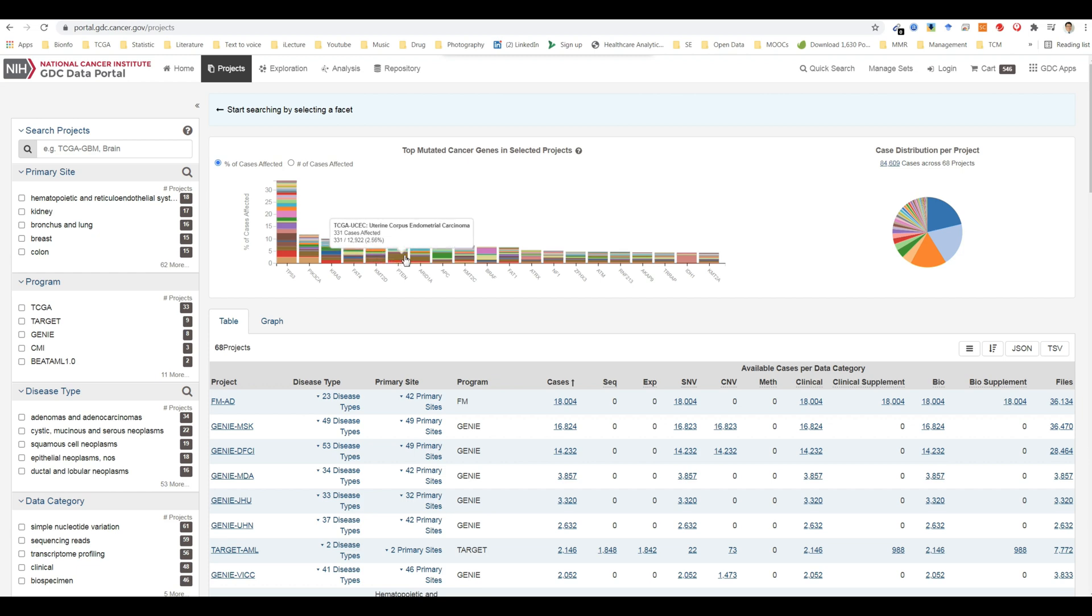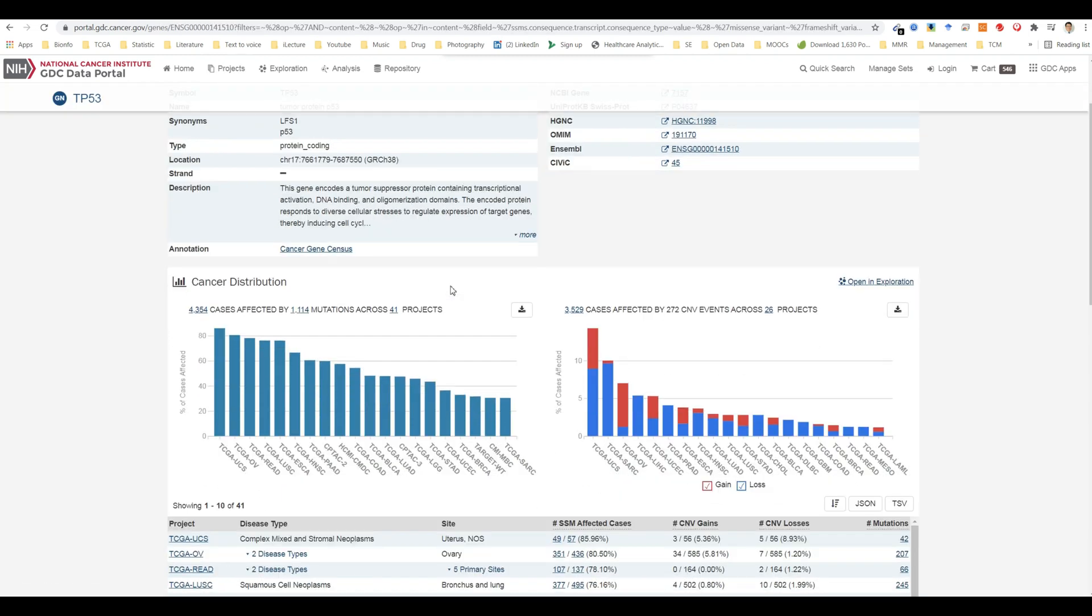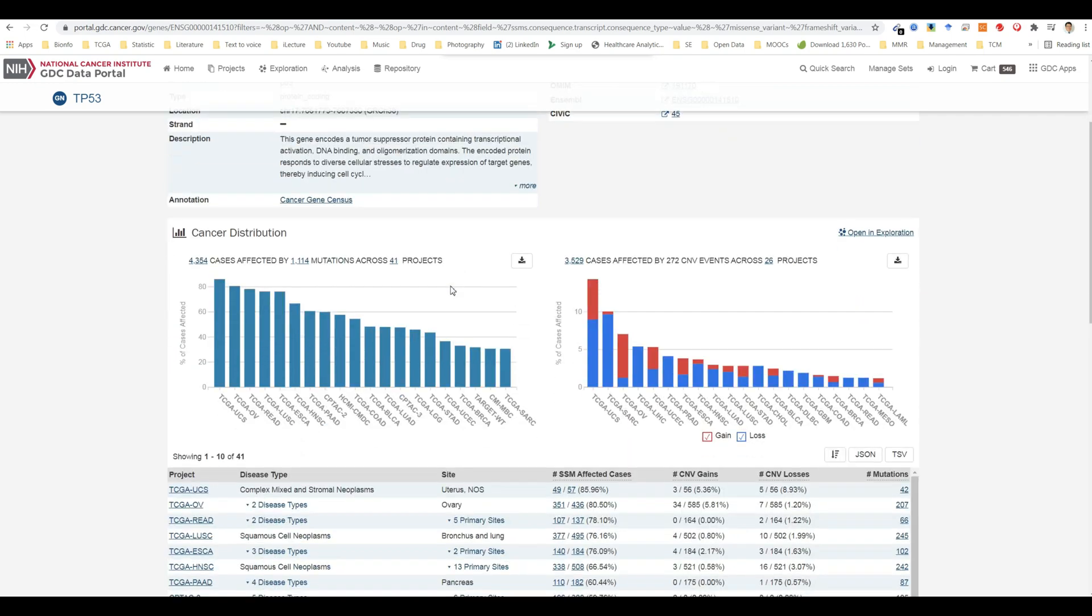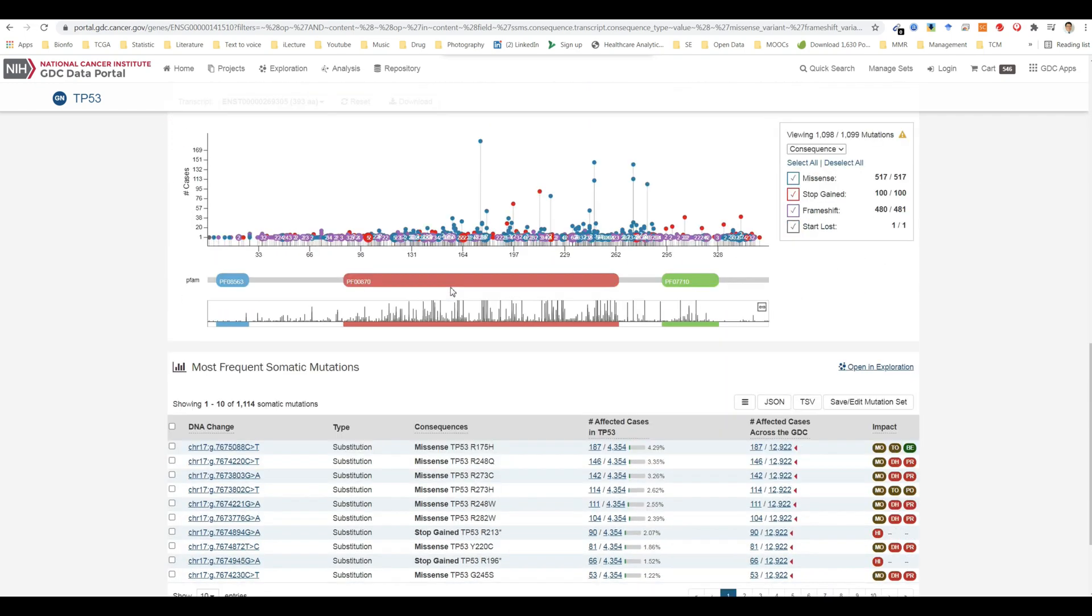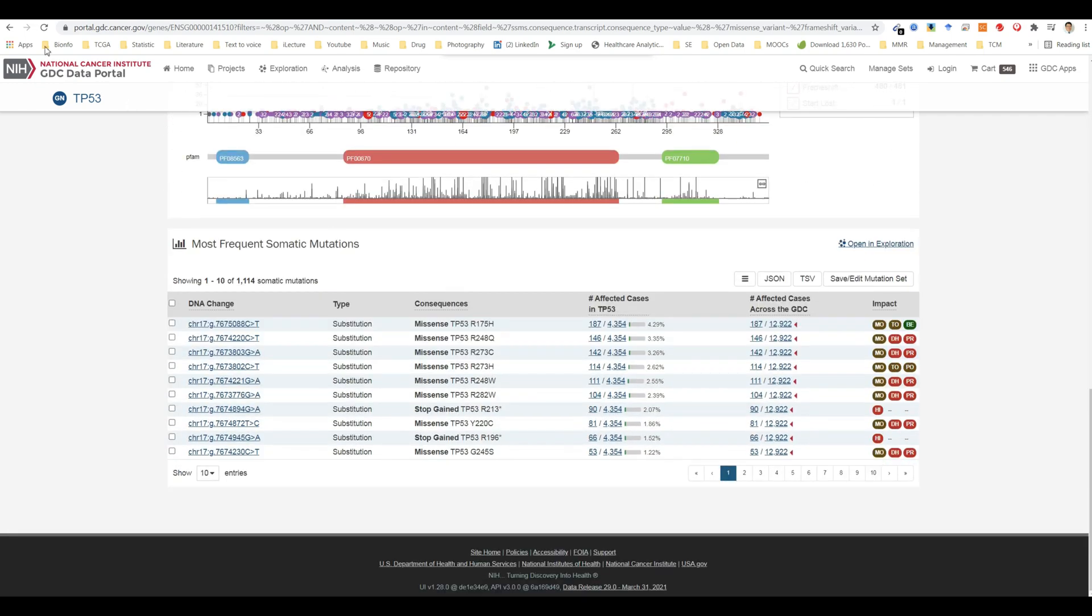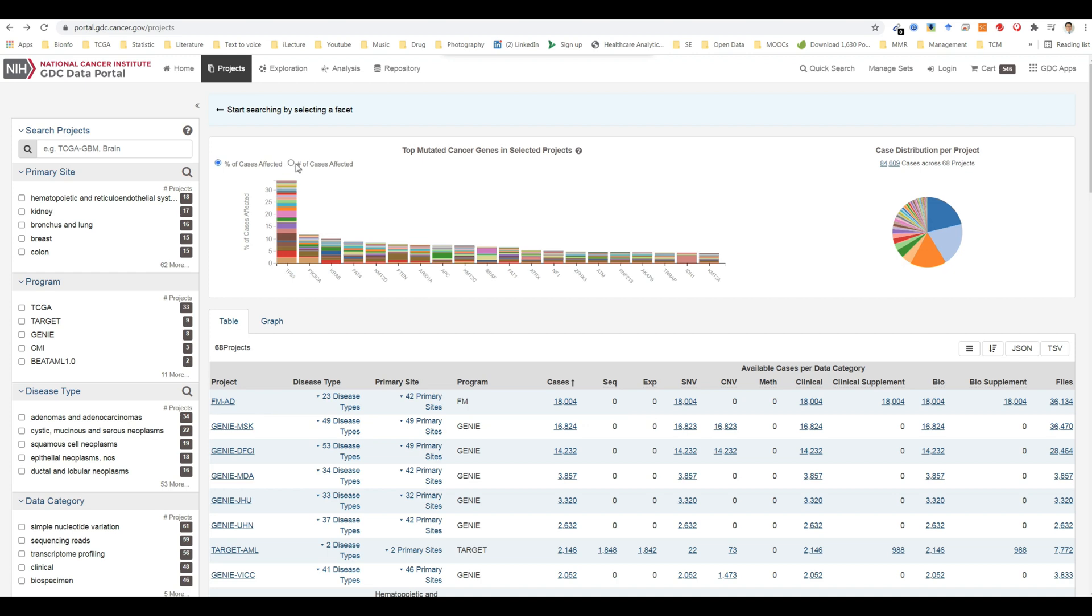Clicking on each bar will launch the gene summary page for the gene associated with the mutation. Users can toggle the y-axis of this bar graph between a percentage or raw number of cases affected.